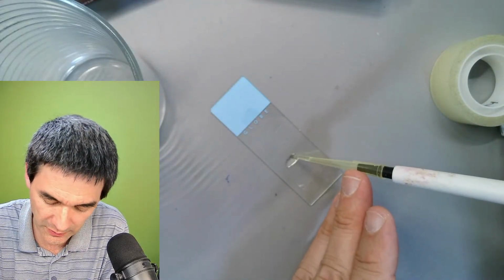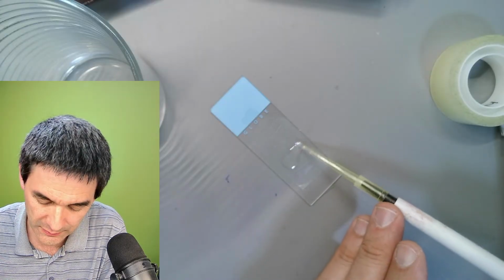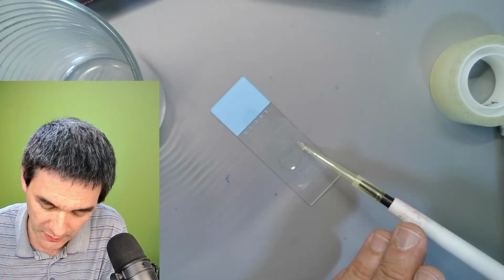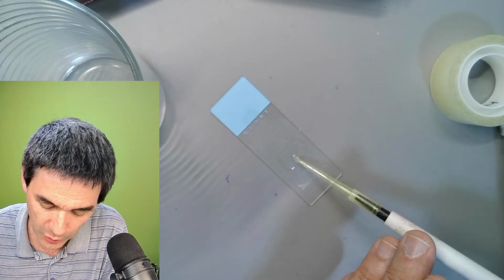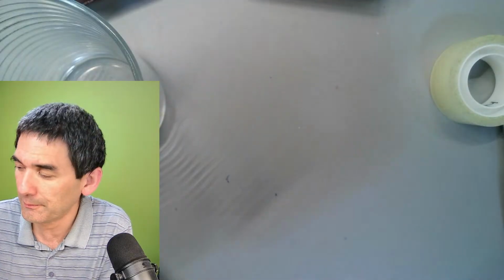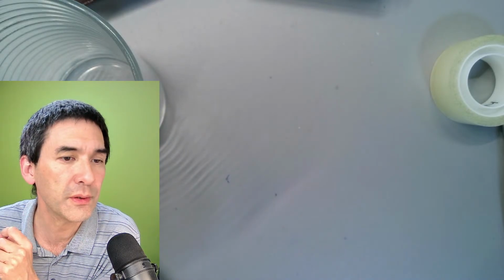Okay, all you want to do is add a little bit of oil and carefully spread it. Because of the refractive index of the oil, the skin will become more transparent. The oil will also dissolve the glue a little bit. And yes, let's go back to the scope view.